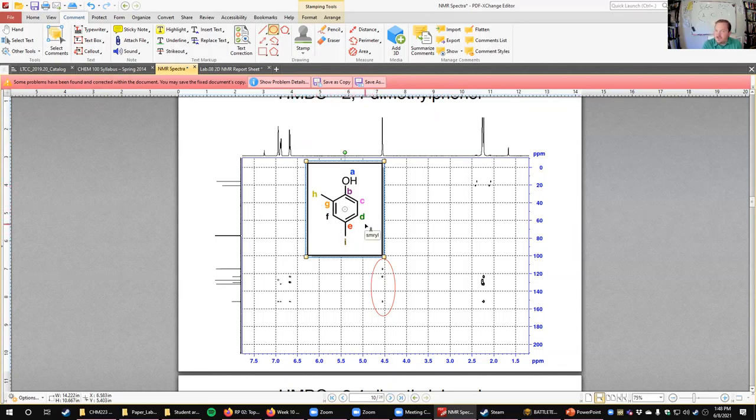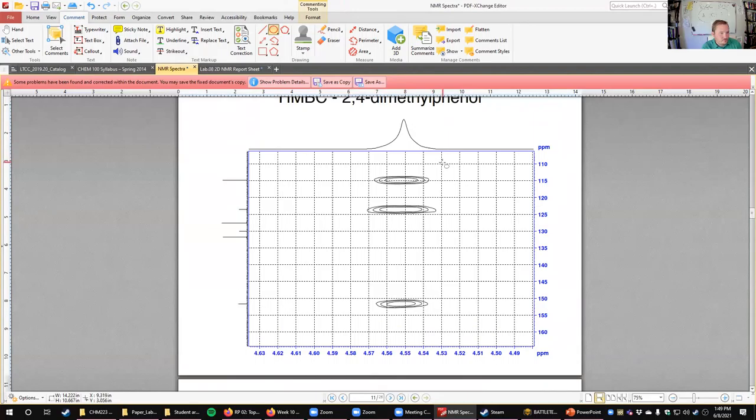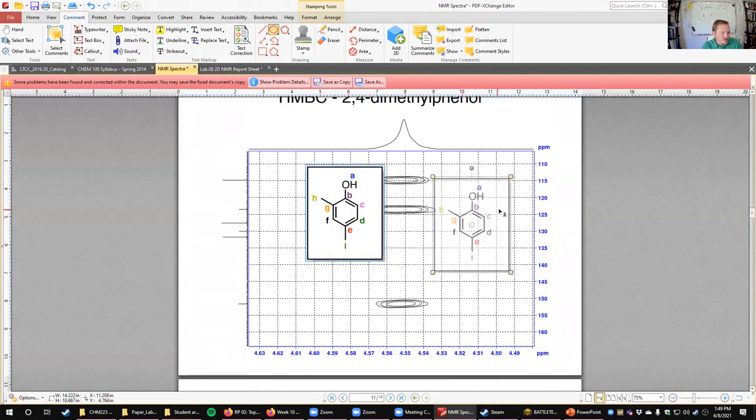Well, again, that doesn't necessarily seem like it helped us that much, except for the fact that up to this point, we'd been basically breaking up the aromatic carbons according to whether they had hydrogens or not, right? We had carbons with hydrogens, carbons without hydrogens. This breaks up that dichotomy because G, B, and C, some of those, C has a hydrogen, but G and B don't. So that allows us to go between those two groups.